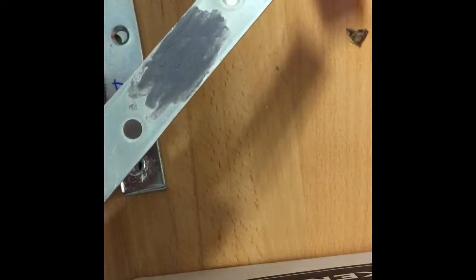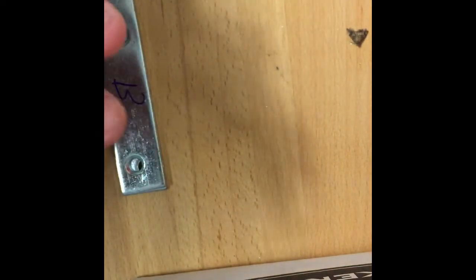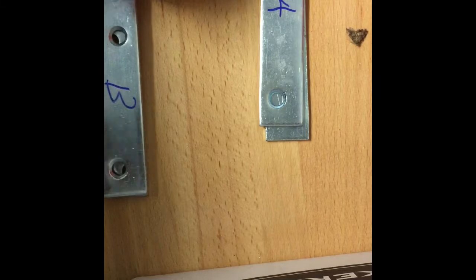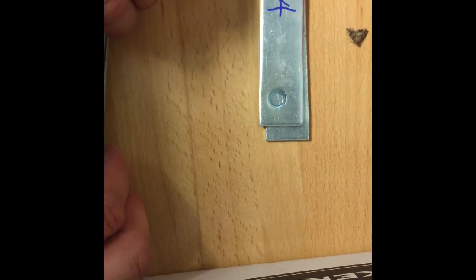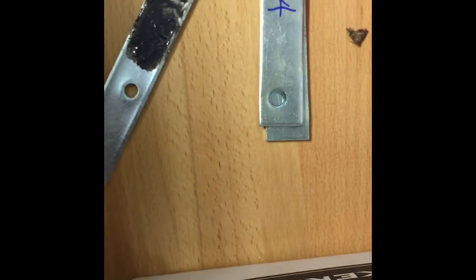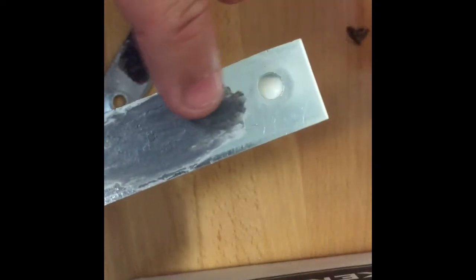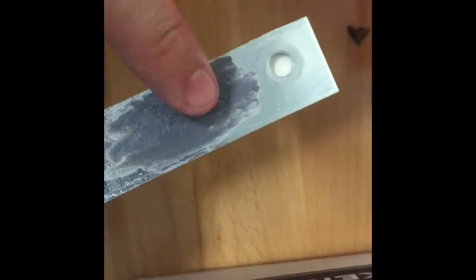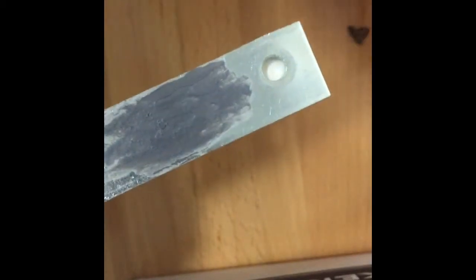Let's see if I can break it up. Yep, I broke it up. Heck of a balance. Obviously, I did not apply a good enough job there. Well, we can see where probably I should have done it on both sides in hindsight. Oh well. We can see here that it has hardened to a great degree. It hasn't done the 24 hours that it wanted under A. But you can see where the hardening has occurred, and this is from the equal measures of the diamine hardener and the resin.